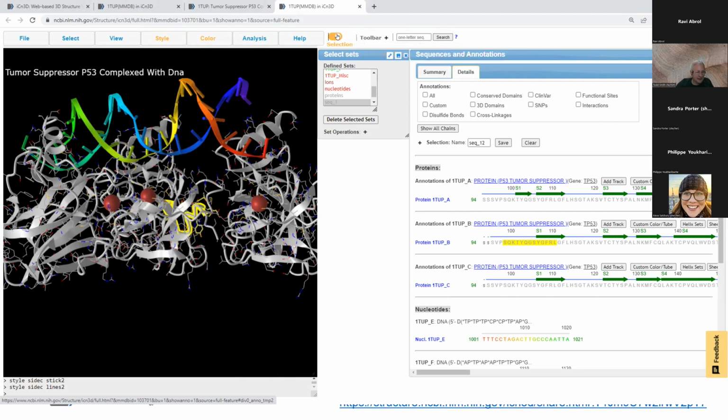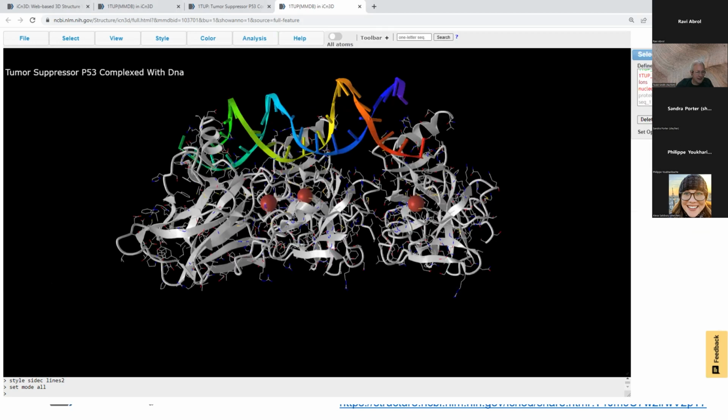And then we're going to talk about selecting by distance, which is one of the things that, when I was doing my PhD, and especially if you're working with simulation data, was like one of the most common things I did. So I think that's a pretty important thing to talk about. For selecting by distance, I'm going to keep selected sets open. Honestly, just the defined sets, I like them. I think it's really easy if I misclick to have this here.